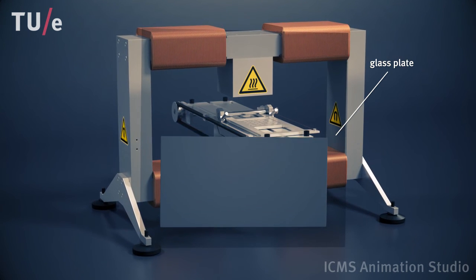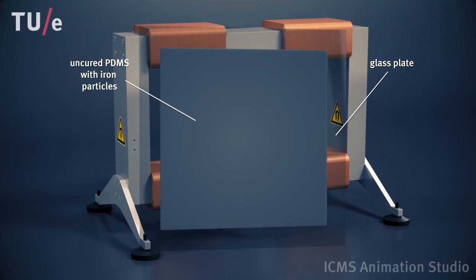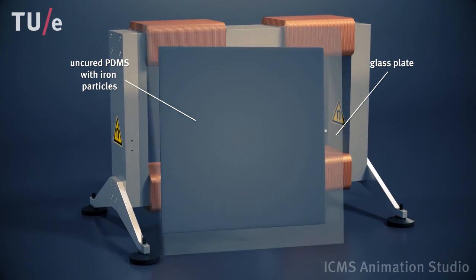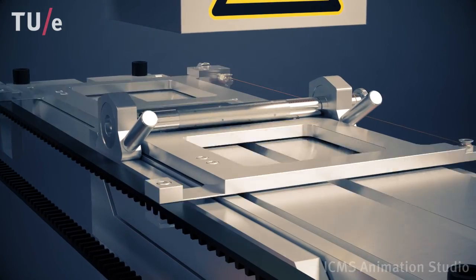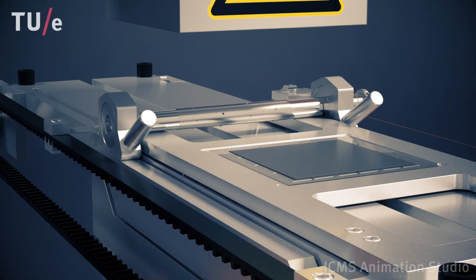On a glass substrate, we apply a thin film of liquid polymer containing magnetic microparticles. This substrate is placed in a home-built apparatus on a moving stage.